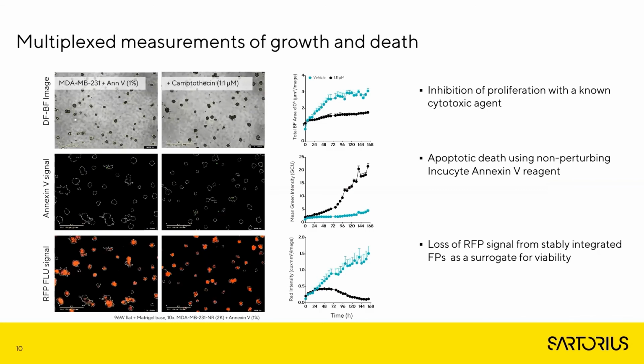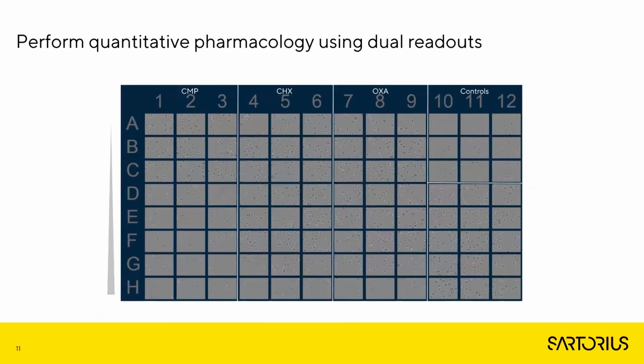And here to illustrate how you can perform robust pharmacological analysis using a 3D multispheroid culture in the presence of an extracellular matrix.